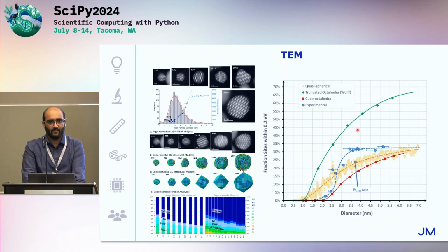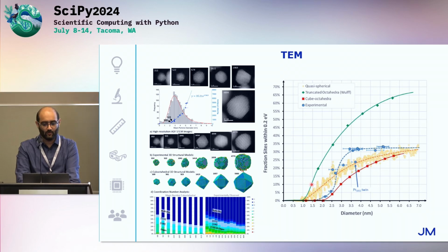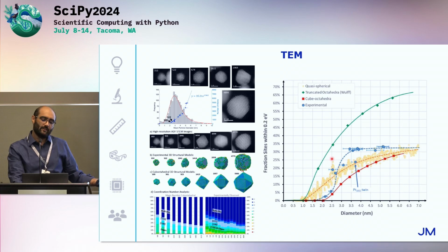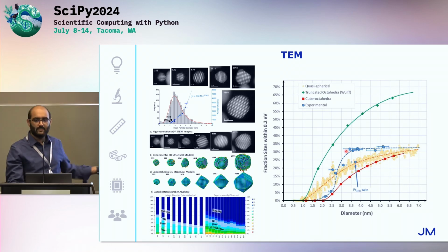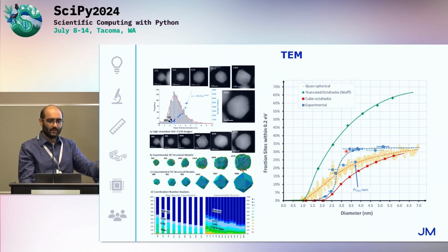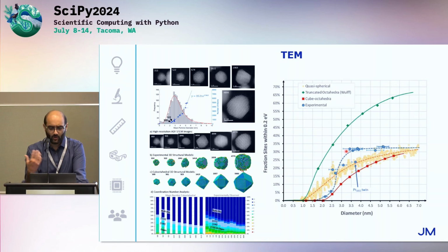And this is where the true science comes in, because now all of a sudden what you have is a very, very powerful descriptor that's telling you, okay, this is your theoretical line here, for example. This is your experimentally observed line. The closer these two are, because experiment's never going to be perfect or your observation's never going to be perfect, that's where the right nanoparticle design needs to be, or that's where you can target the chemist to then go and work on to create particles of that type of shape for a specific reaction.